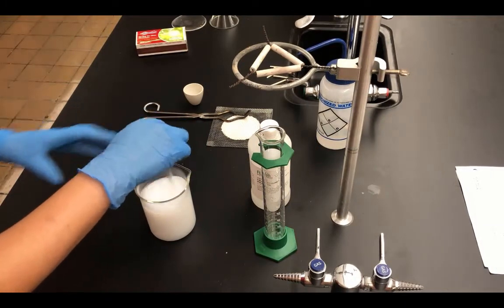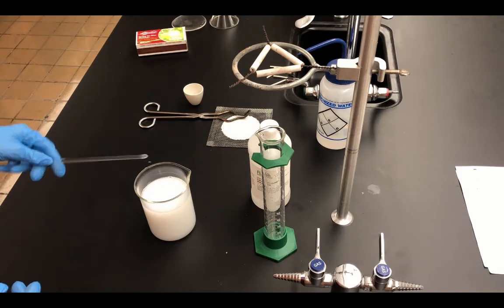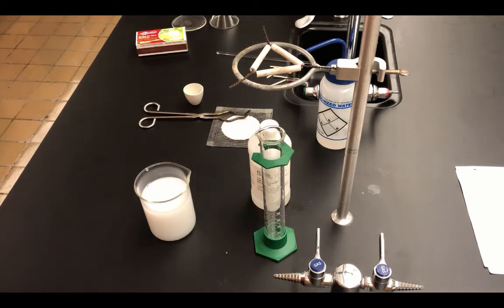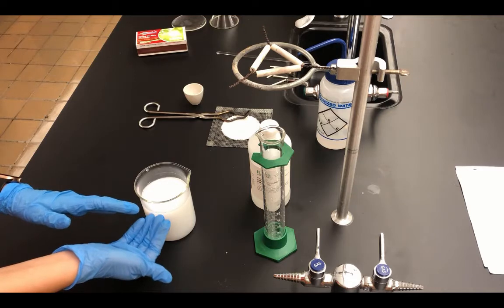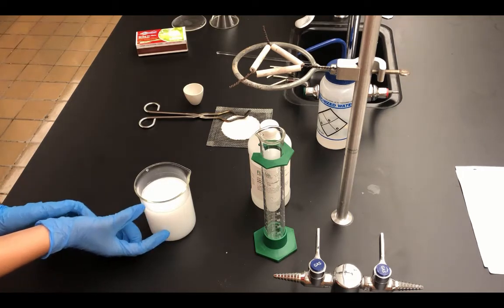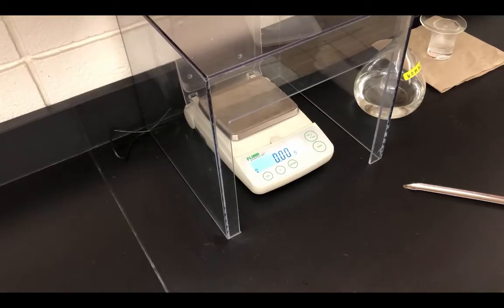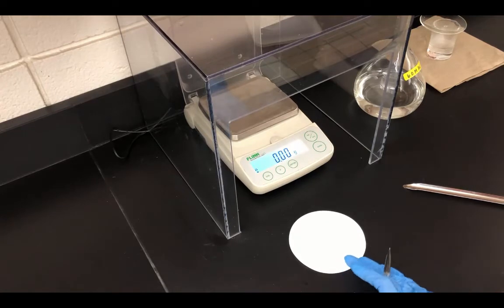Now I'm going to let this precipitate settle for about 5 minutes. Hopefully we see that the precipitate, the solid, will settle to the bottom, and that will leave just an aqueous solution on the top. While we allow the precipitate to settle, we are going to prepare our filter paper and the filtration setup to filter the solid from the aqueous solution.